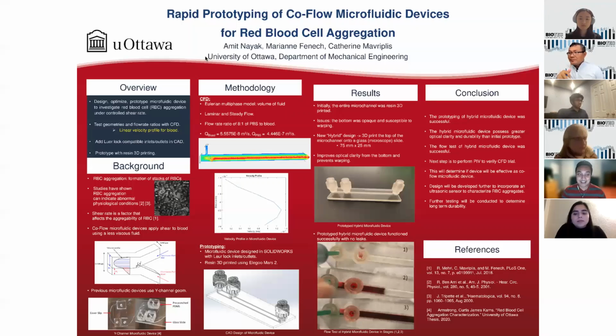So at this point, I haven't actually been able to connect it to syringe pumps yet because most of the equipment in the lab we're trying to fix so we can actually test it. So I haven't actually gotten a chance to test controlled flow rates in the actual microfluidic device. So I didn't get a chance to look into that.